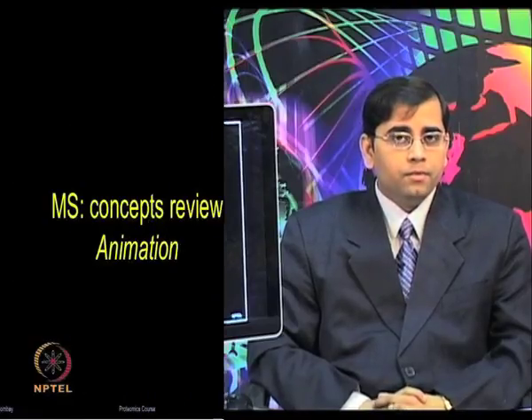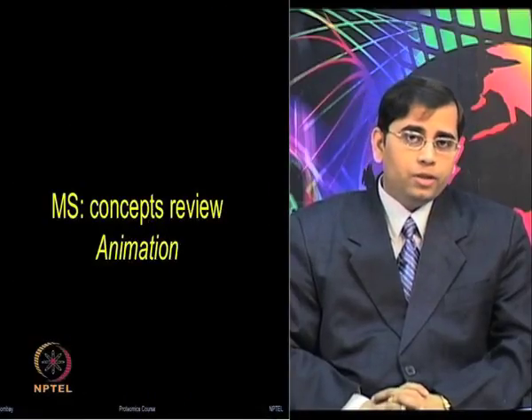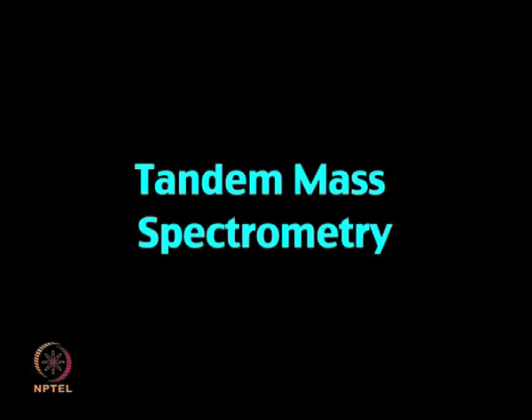Some of the important concepts involved in ionization, mass analyzers and tandem MS, I will describe in the following animation. Tandem mass spectrometry. Let us first discuss the individual components, the ionization source and mass analyzers, and then how one can make use of various types of ionization sources and mass analyzers in tandem for mass spectrometry analysis.